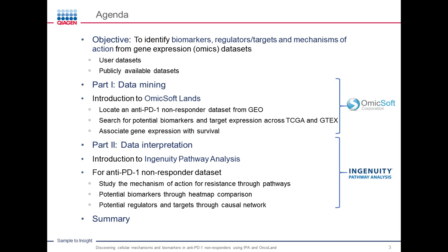In part two, we're going to study the remainder of the dataset. In part one, I just mentioned two genes. So in part two, we're going to do data interpretation using Ingenuity Pathway Analysis. We're going to learn about what this software is and how it can be used to study mechanism of action, biomarkers, and regulators. And then we will end with a summary.